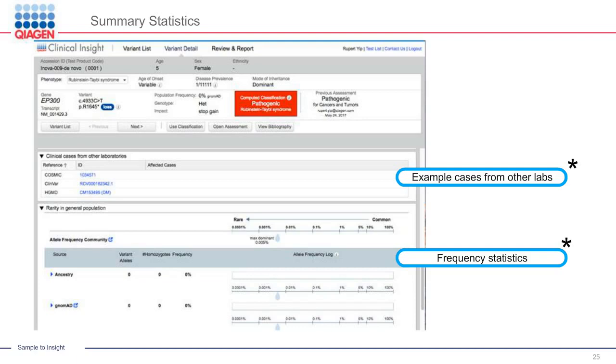And additionally, again, because we have ExAC and of course gnomAD, and a number of other population-based data pieces in the knowledge base, we can also look at frequency of these variants, so the allele frequency in different populations, and substratify actually by ethnicity as well, which is a nice feature if you're looking at a particular ethnicity.